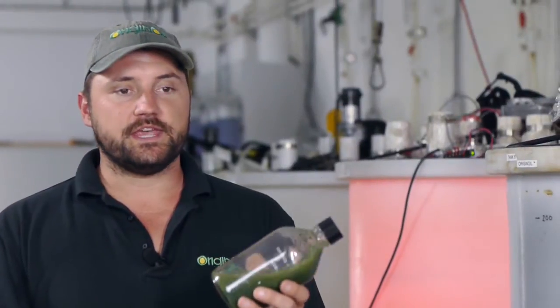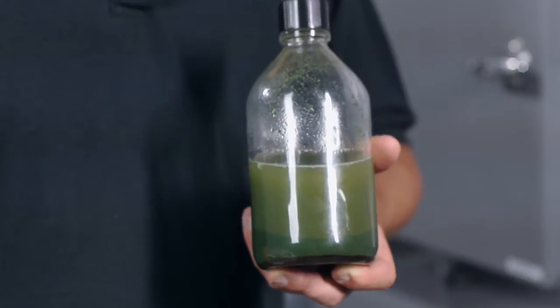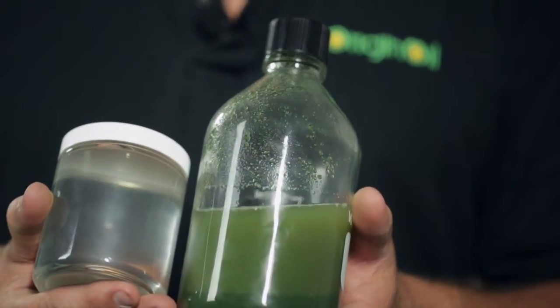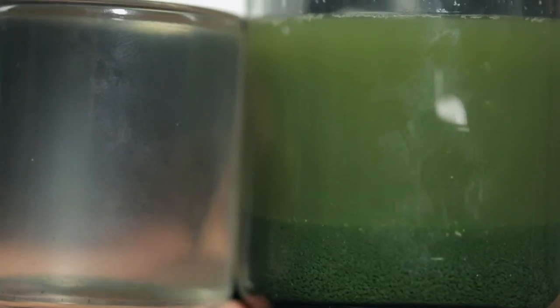Here you can see a sample of the microalgae that entered into our system. Here you can see a sample of the water that came out of the system and you can see the difference between these two jars.